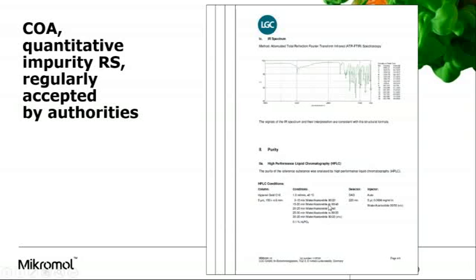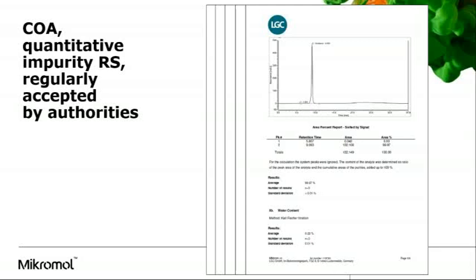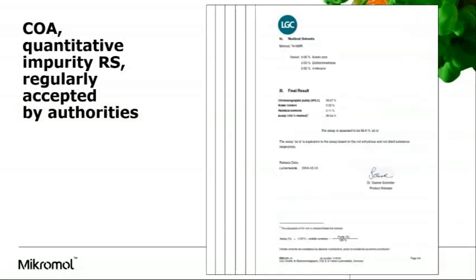Here the HPLC conditions used to look for potential impurities, and the chromatogram, in this case showing a small impurity at 0.03% before the main peak. Along with that, the water content, in this case 0.22%. And then finally, residual solvents, which were quite low for this material. And then the 100% minus method was used, and the results shown here as 99.6. So you know the basis for determining that result.